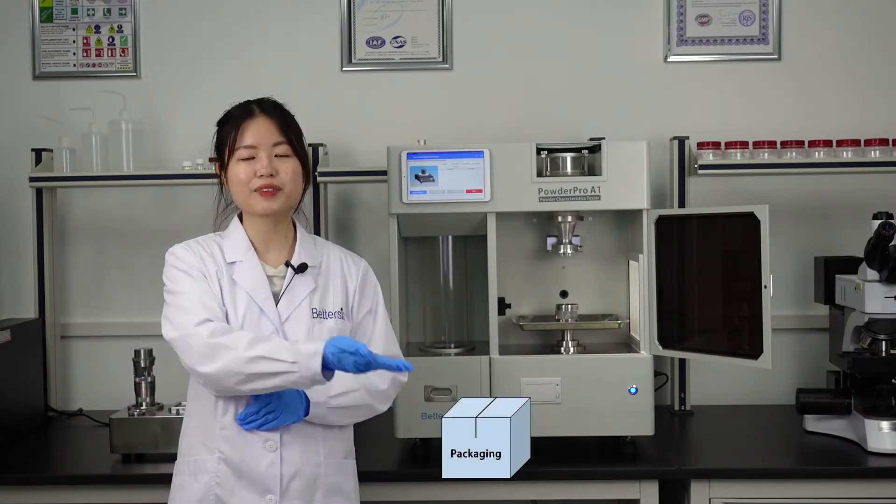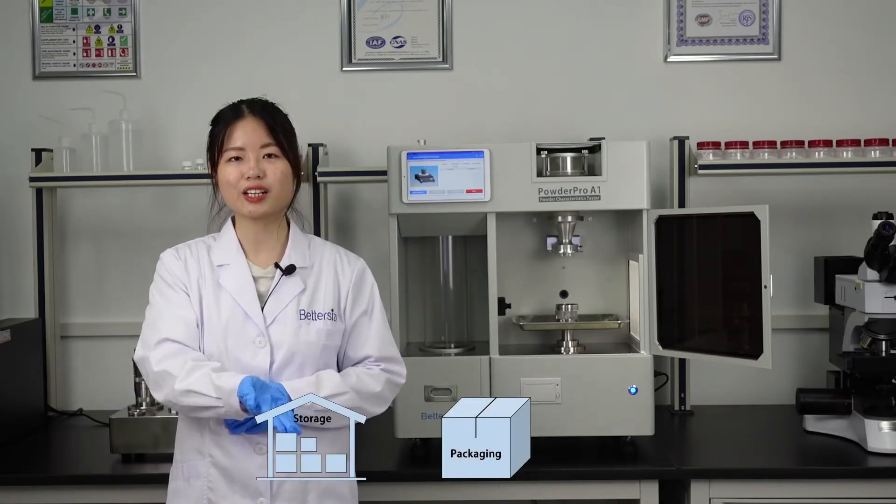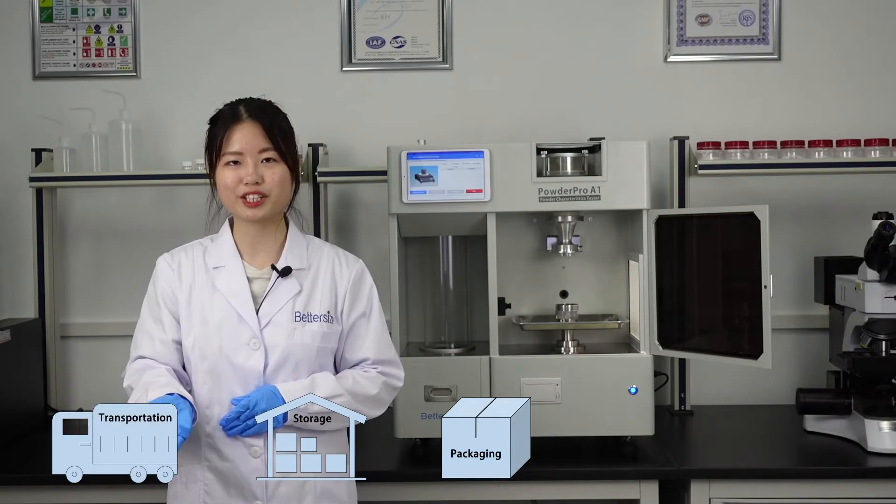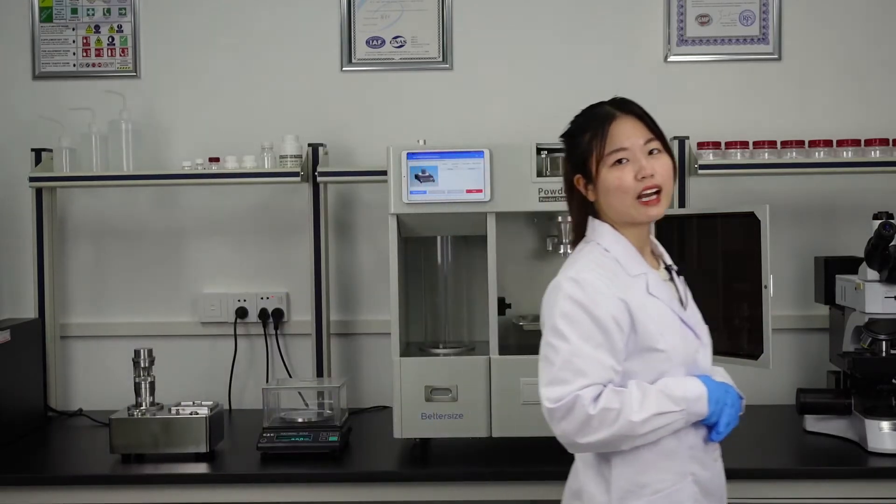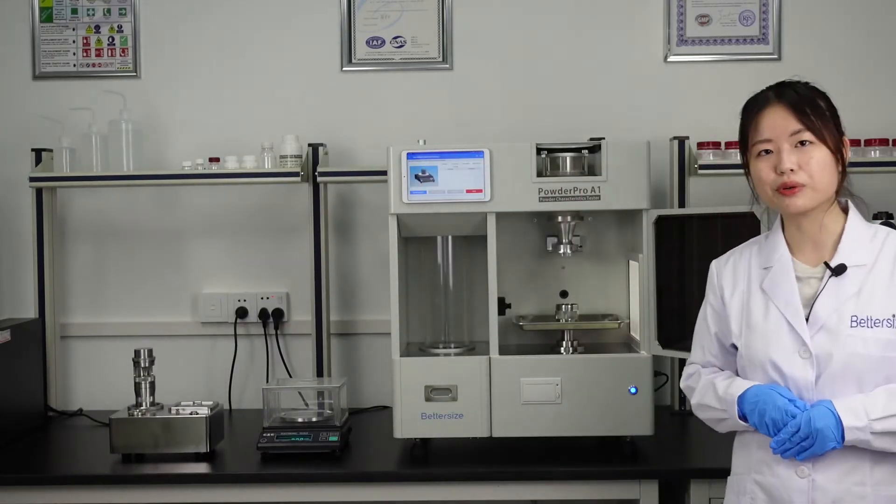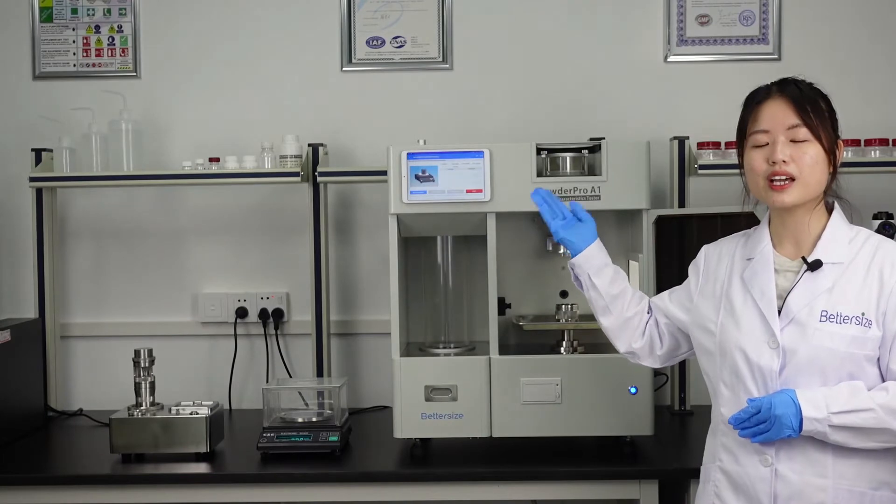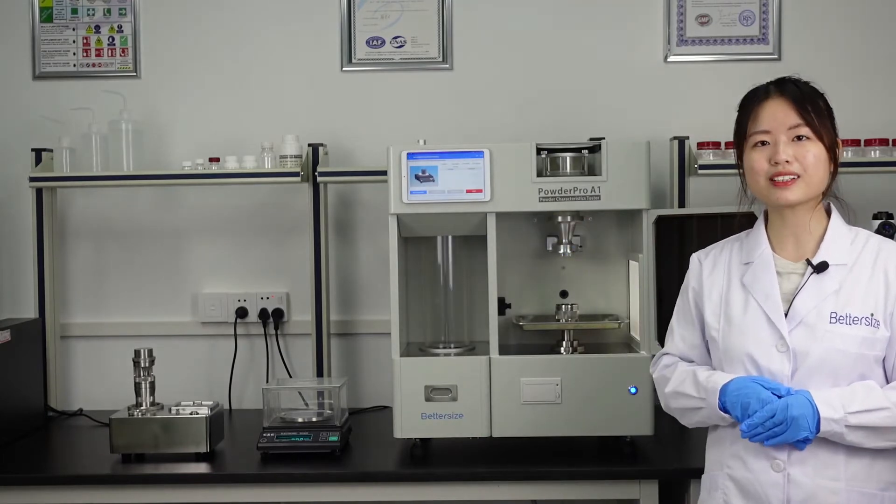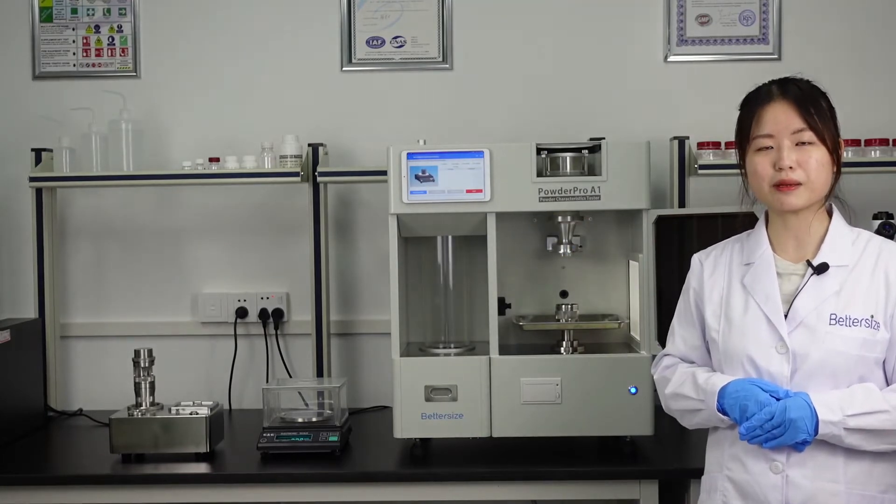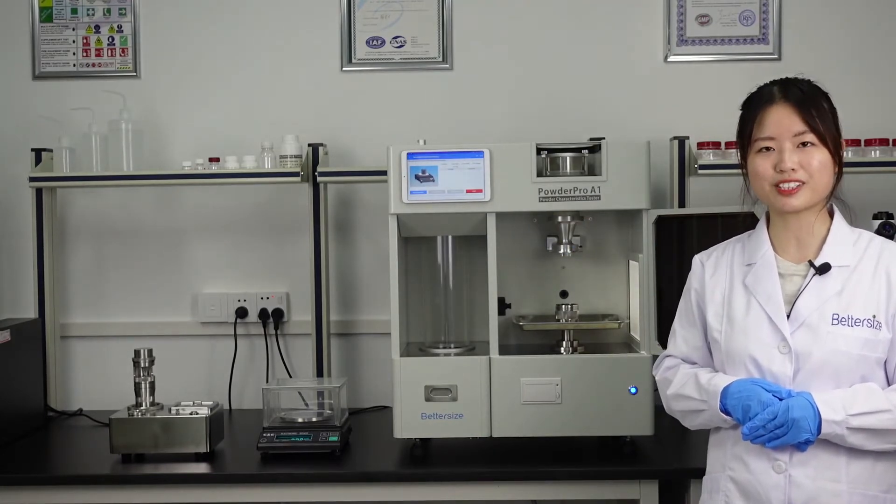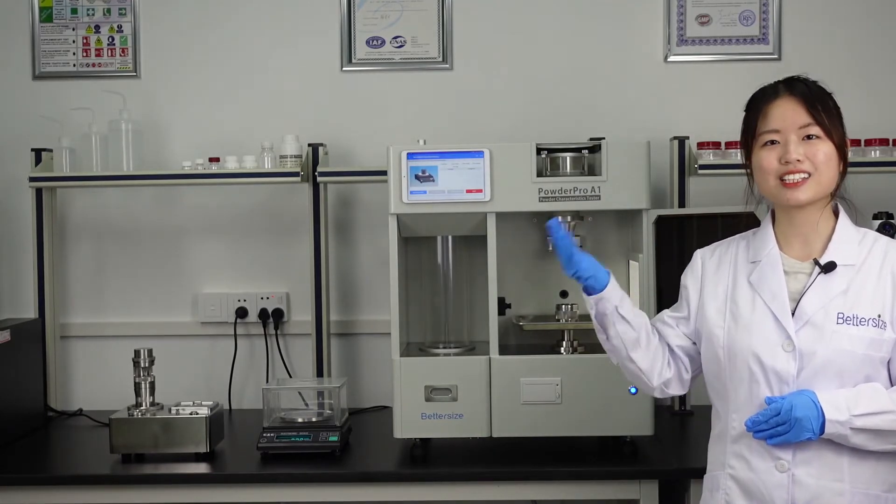The bulk density and tap density are very important parameters for powders, packaging, storage and transportation. Today I'm going to show you how to use the PowderPro A1 to measure the bulk density of non-metallic powders. Let's start!